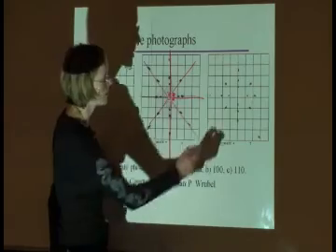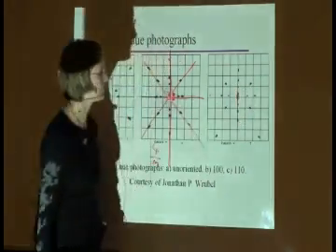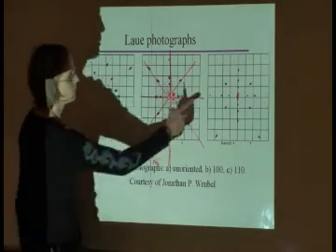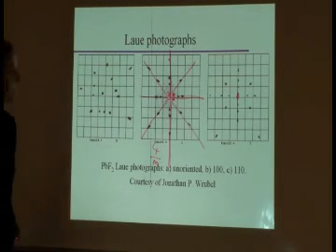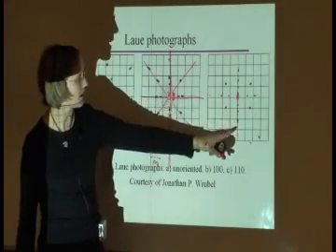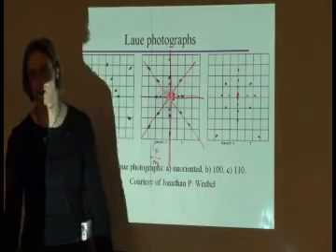And a lot of people are nodding. Sure enough, it does have twofold symmetry. Once again, you're missing a spot. I think in this case it's actually because it would be off the plate. Okay, so you just happen to not measure it. This one is not fourfold symmetry because these spots are at a different distance than these. Okay? Do I have mirrors here?